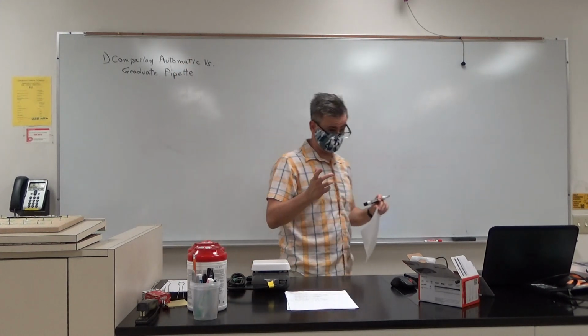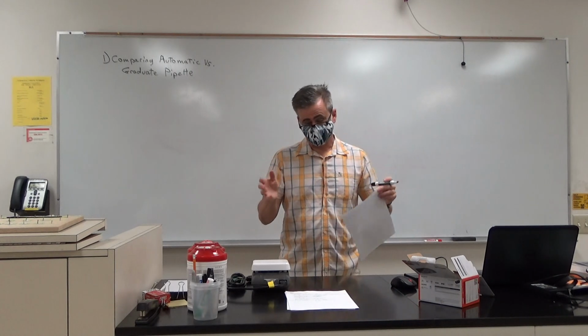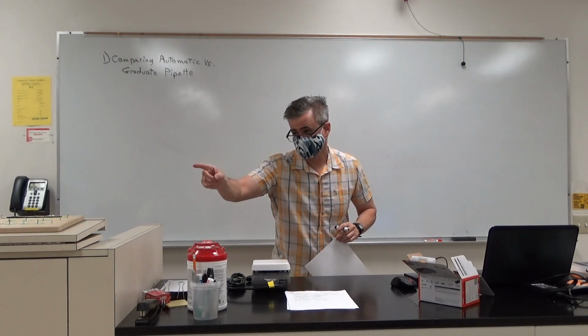Let me ask you something. You guys all read this. Are we comparing these two pipettes in terms of their accuracy or in terms of their precision? Remember that's close. Yeah, exactly. That, by the way, is my favorite teaching joke. I never tire of it, and you will hear it all year long. Fair warning right now. And I love it when students lob me that opportunity to use that cheesy joke. Okay, so no, we are comparing accuracy.